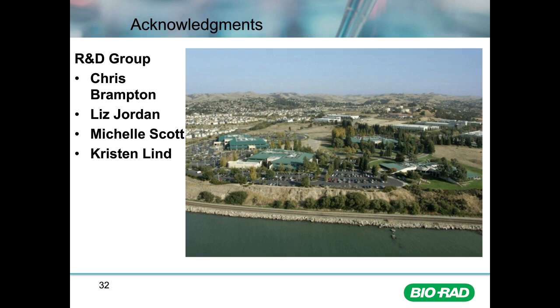Another question from Tatiana. She wants to know, do you expect to see the same changes in tumor cells? I would expect, if we were using clinical samples and using immune cells from a tumor model, to see hopefully more dramatic changes depending on the type of cancer model that we were using.